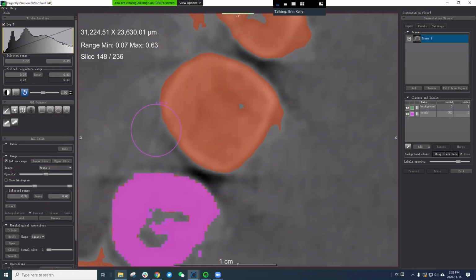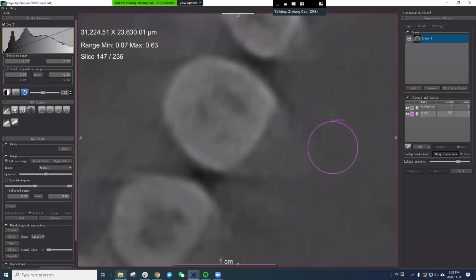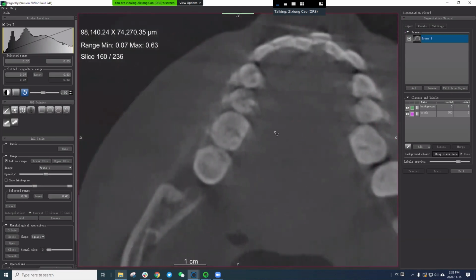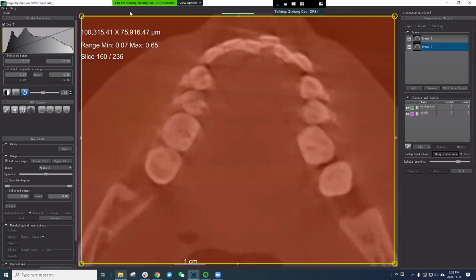Sorry, how did you create the frame? Oh, you just add. Add, thank you. Yeah. You just add. You will create the frame on the current slice. You see the slice number here. If you move, we can move to another slice. Then we add again, and it always adds the current size of your window, your image view. So if you like this, you add this size. If you zoom in, you will get a smaller area. Okay, great. Thank you. You're welcome.